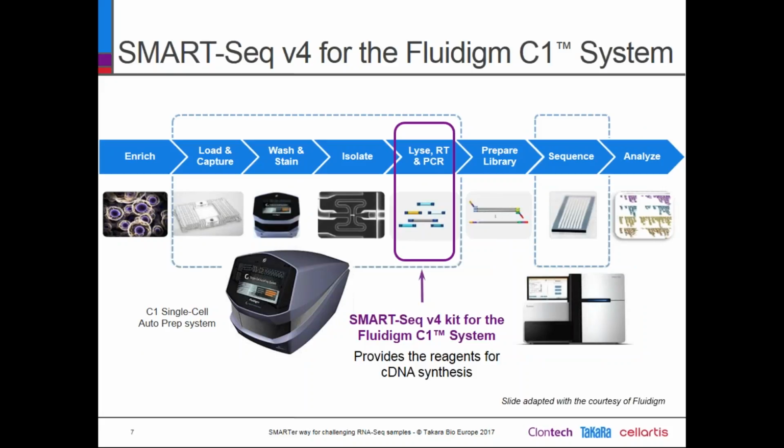So of course you can do that manually, let's say, but there is also a version of this technology which has been developed for this instrument, which is called the Fluidigm C1, developed by another company called Fluidigm. And what it allows is to automatically load and capture single cells in different wells of a microchip, and it will add all the reagents that are required for the reverse transcription and cDNA amplification using SMART-Seq v4 reagents.